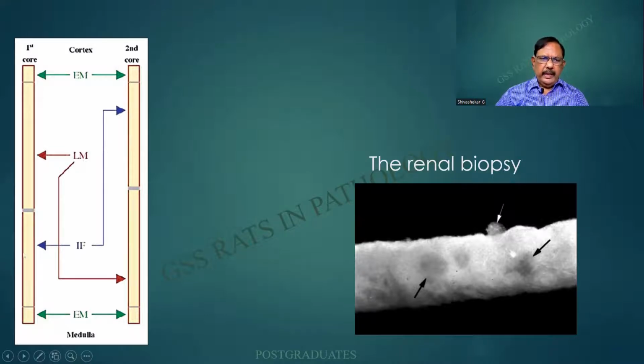And they take for immunofluorescence one distal end, and for the other one they take the more proximal or probably the subproximal end. Similarly, for light microscopy also there is a variation. So obviously it is something similar to your differential count that you are doing. They do not want to miss anything anywhere.